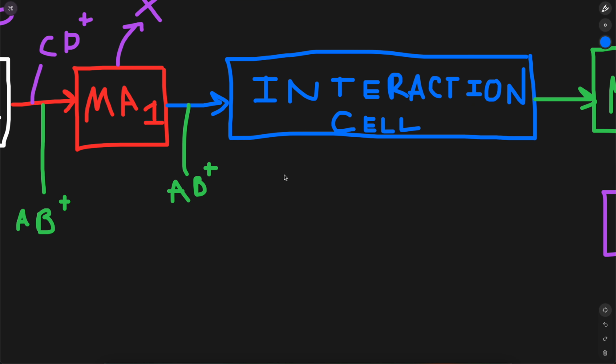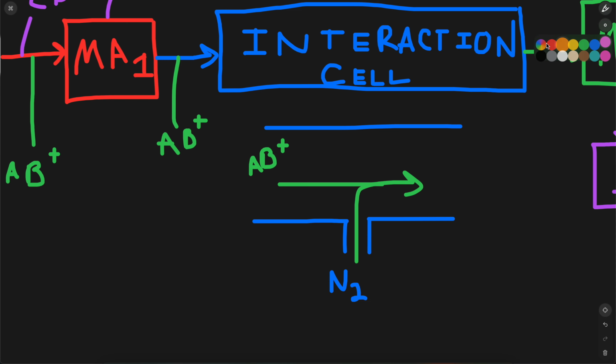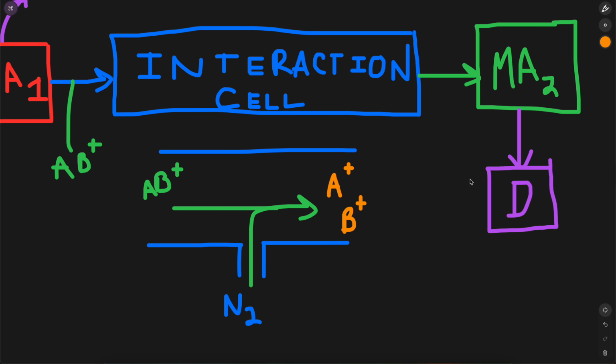We take argon or nitrogen gas, and let's say here's that vessel. Let's say there's an inflow of N2 here. We have a little N2 inflow, and that's going to come in here, and with that reaction we're going to have AB plus, and when they collide, what's going to happen, you're going to get A plus, and you also might get B plus as well. So you'll get both species of fragments.